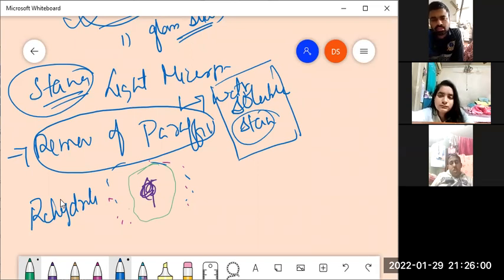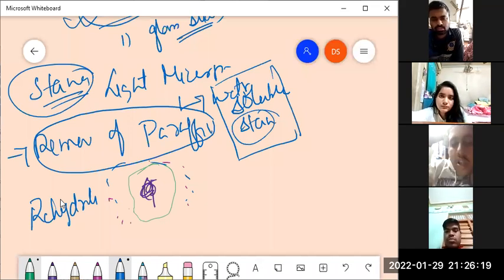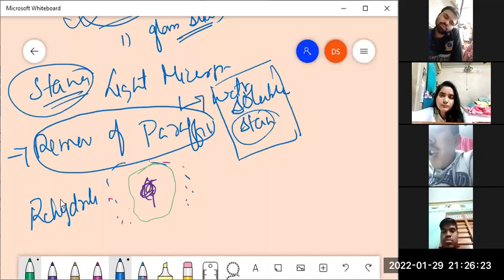That is, if we are not dehydrating the tissues, the successive stages of embedding and thereafter sectioning cannot be performed, because for sectioning, we need to have a hard substance. If water is retained in the tissue, it necessarily would remain soft. So in order to ensure that the tissue becomes partly hard, we do need to dehydrate.